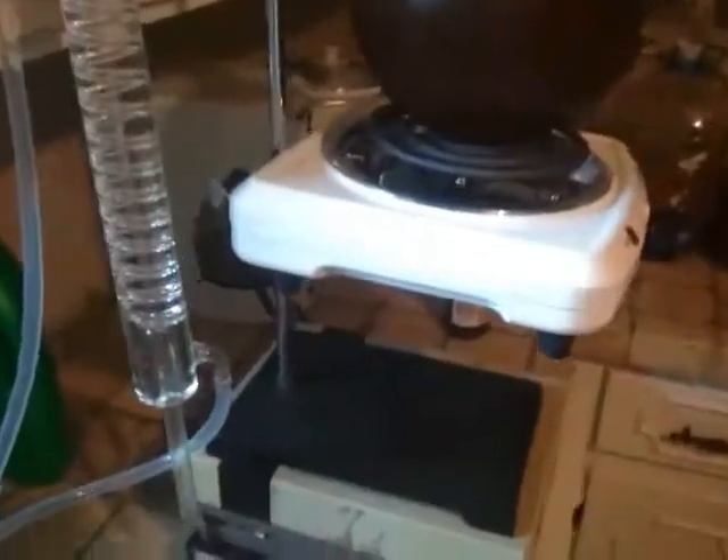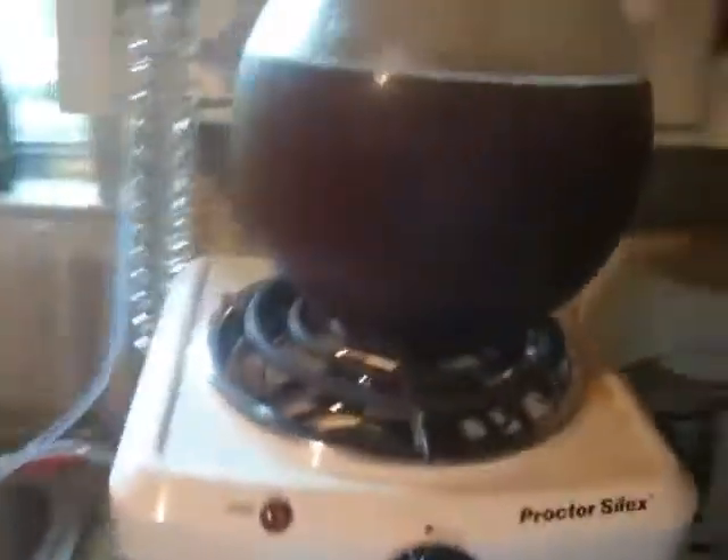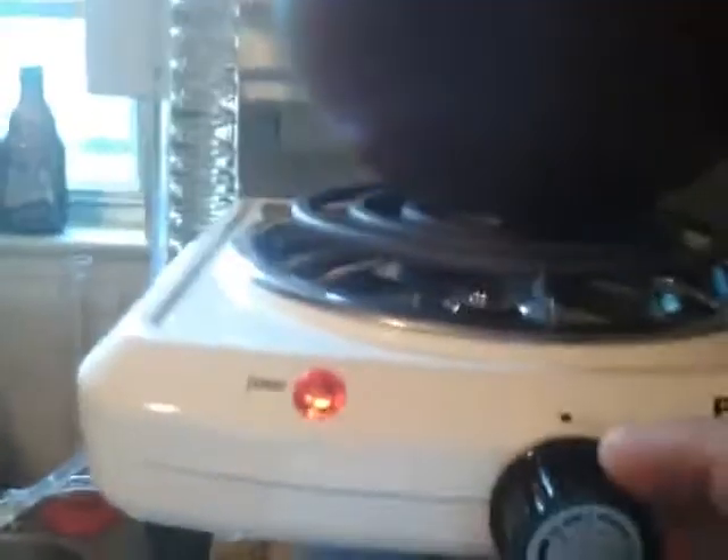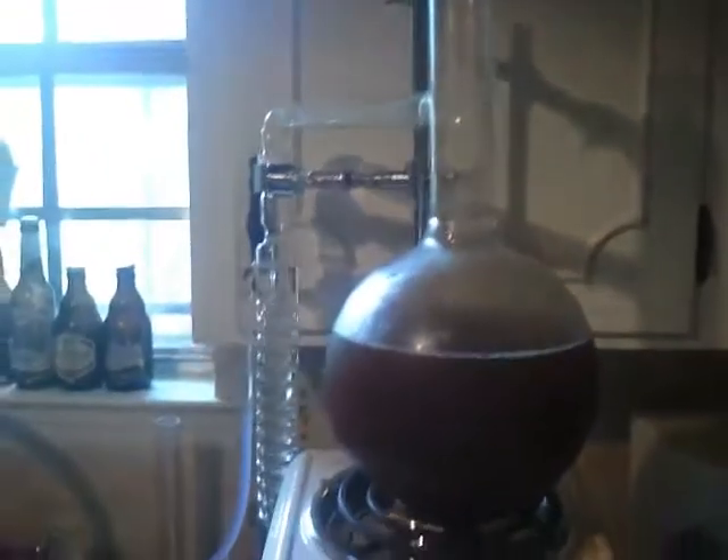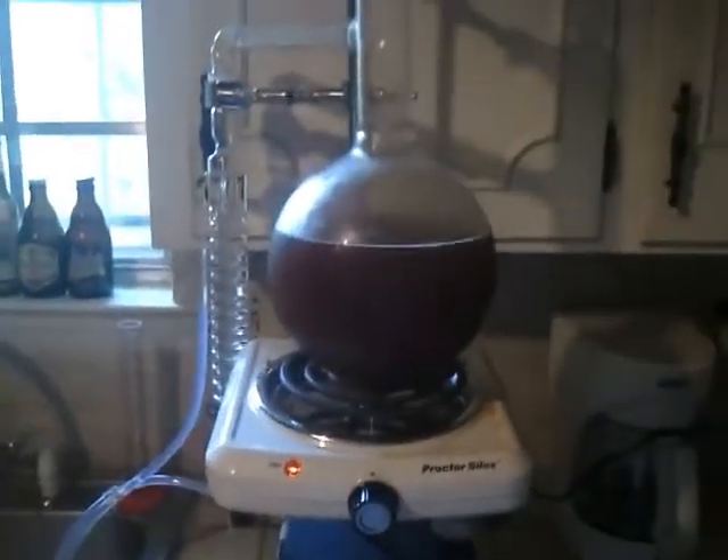That shouldn't be too bad though — it might have a little more flavor. I'm gonna start it off on low heat. We'll go about 30 minutes and see. All that'll clear as the alcohol starts to condense.